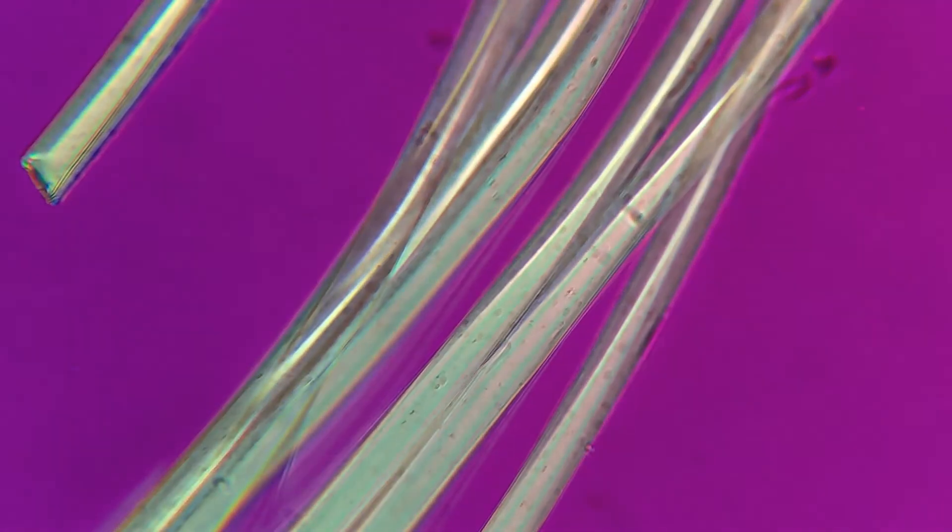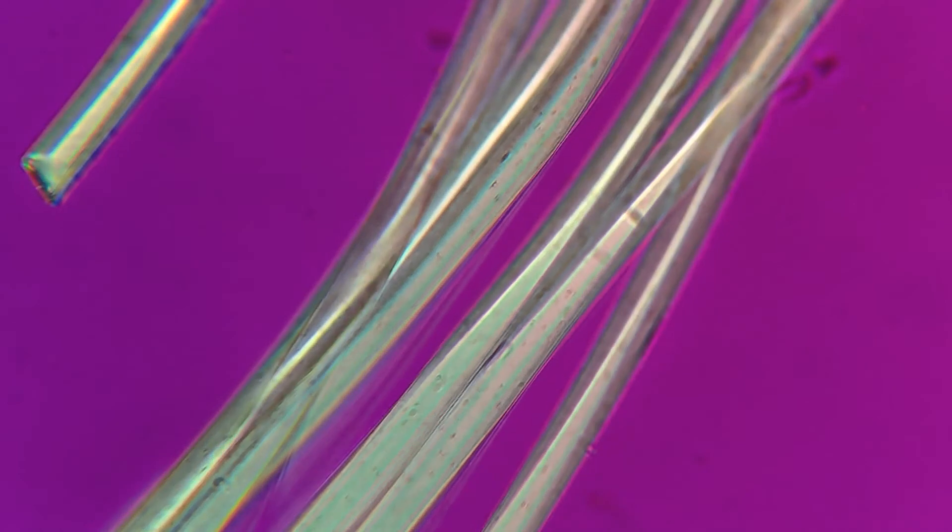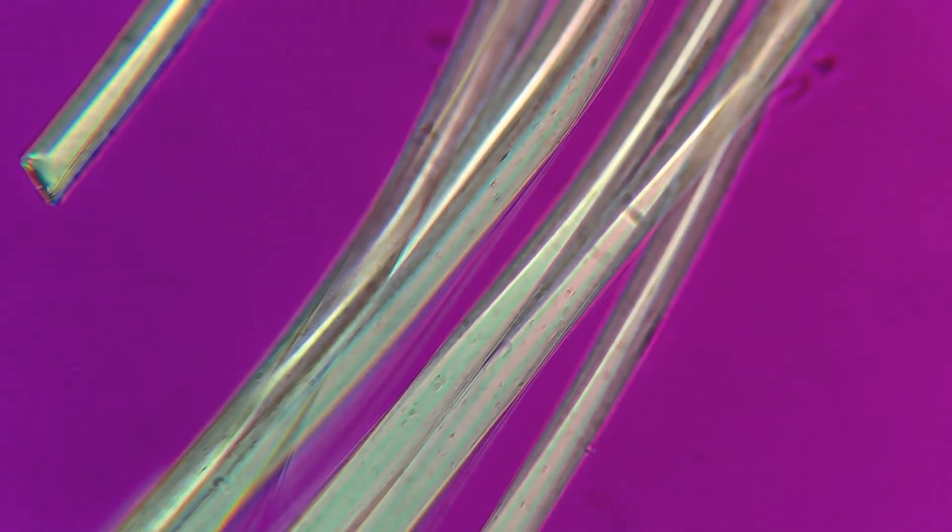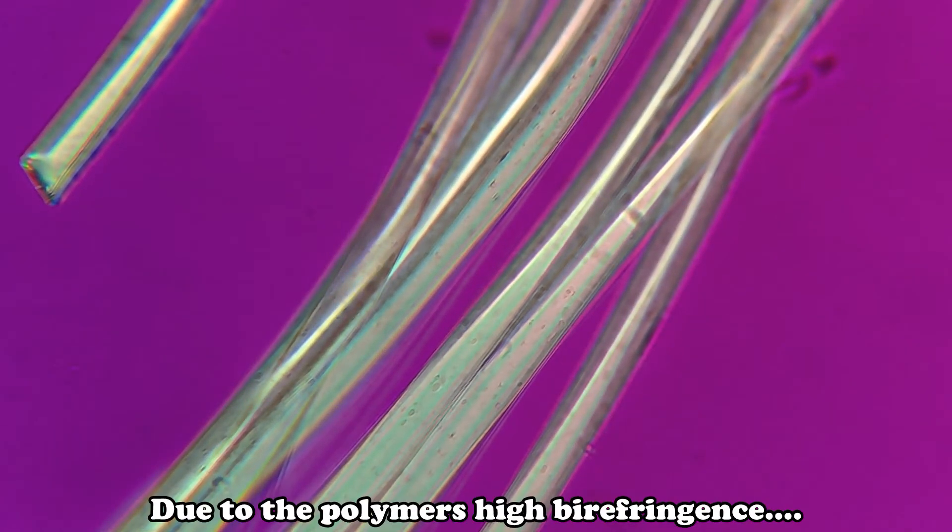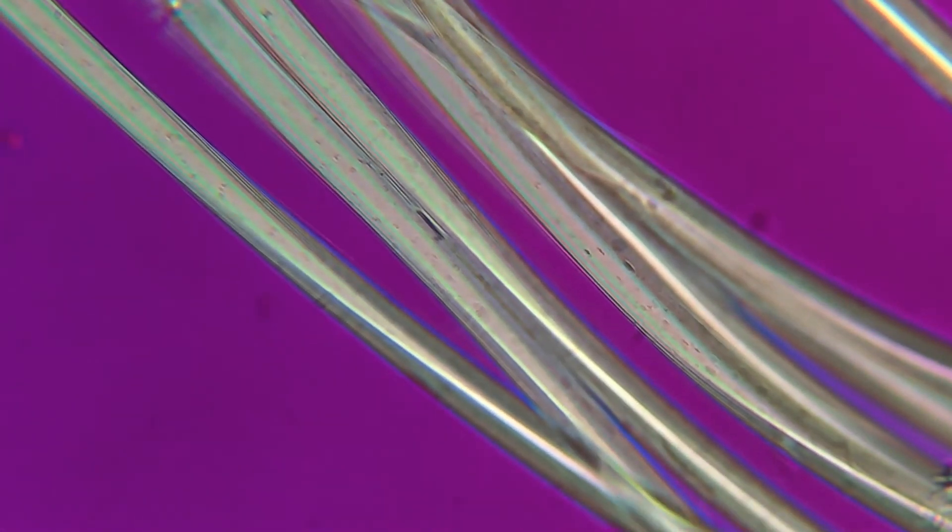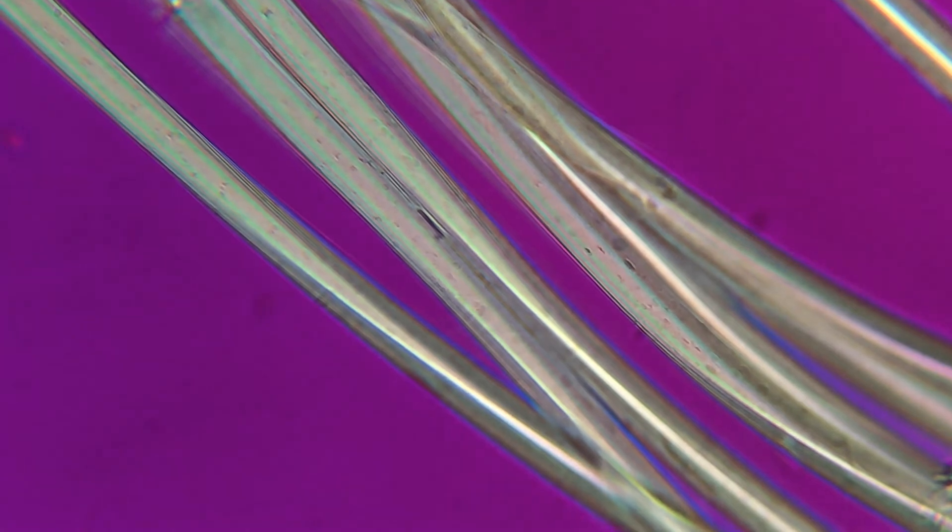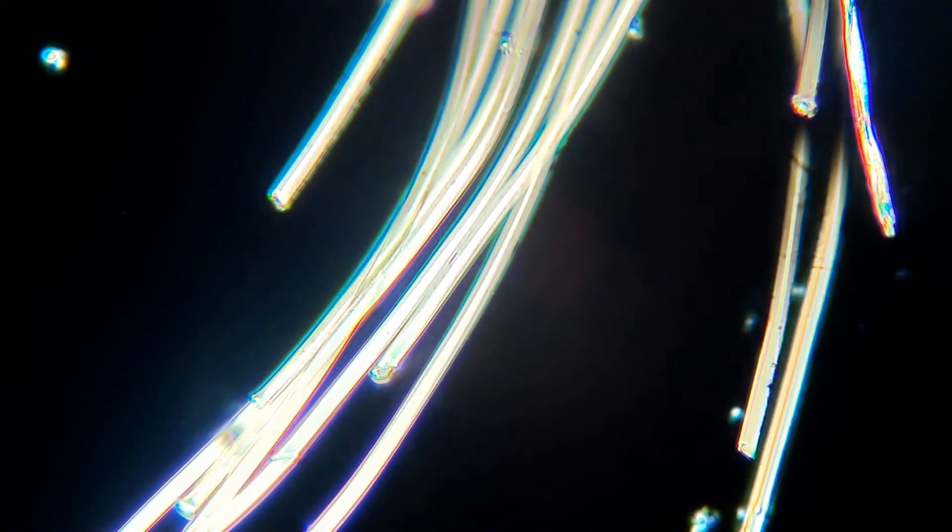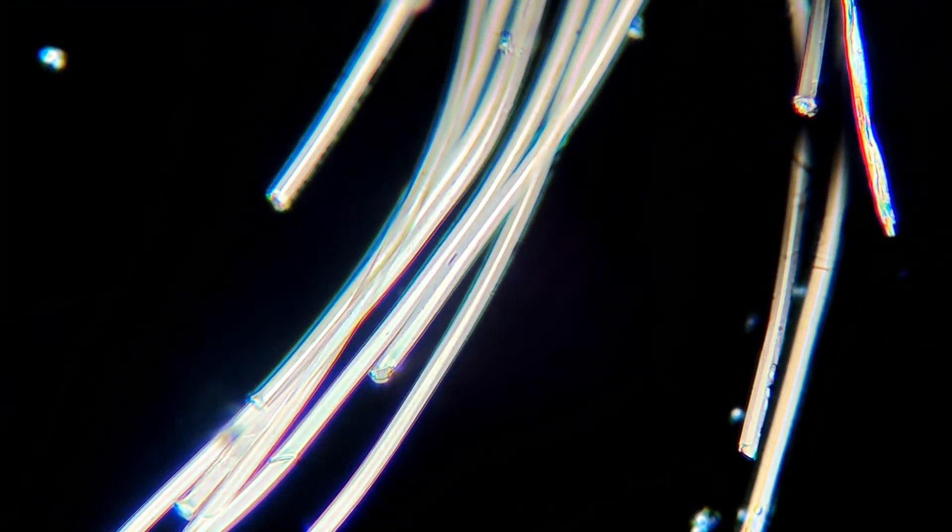Polyester exhibits a positive sign of elongation. However, due to the material's propensity to be difficult and display a more uniform yellowish color, it can require examination by Becke line to determine this characteristic. This polymer also exhibits a very high birefringence.